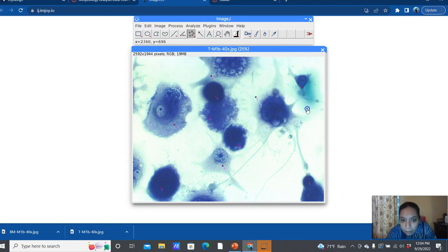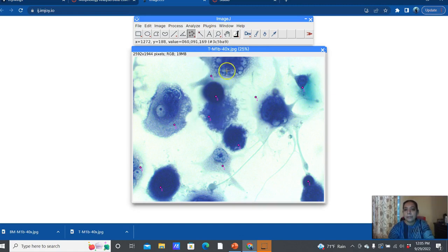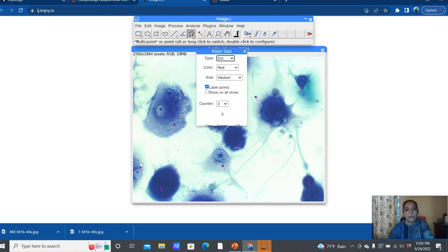Okay, so now that we have all our cells, we can go ahead and look at the next category, right? So I'm going to go ahead and count the number of nuclei. And so I'm going to go back and go to category 2, right? And I want to make them a little bit bigger. They seem really tiny right now. And click OK. And now I can go ahead and measure my nuclei. So I'm just making sure it's on 2.